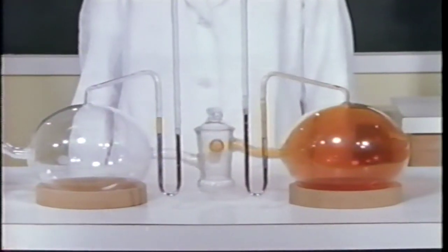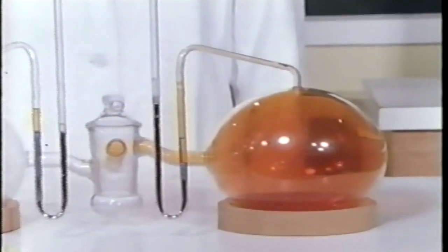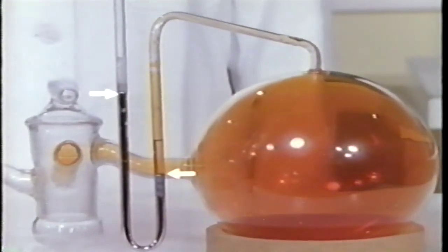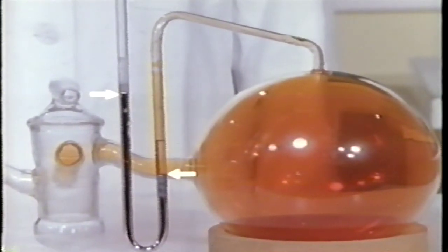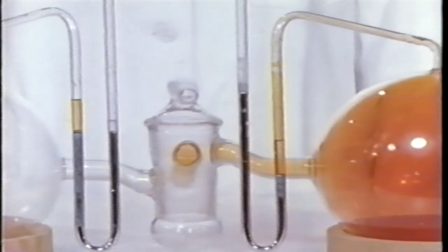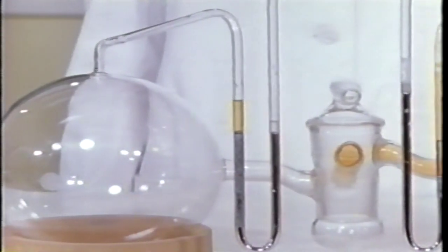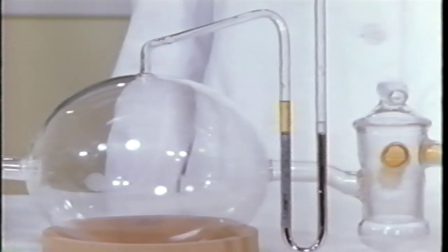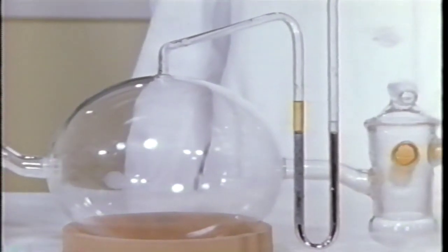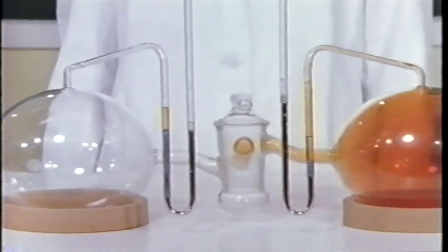Now let's look at these two glass bulbs. The right-hand bulb contains the colored gas bromine. The mercury levels in the manometer show that the bromine pressure in the right bulb is about 100 torr. The oil in the manometer is there to prevent reaction between the bromine and the mercury in the manometer. This second bulb has been emptied with a vacuum pump. The mercury levels in the left manometer show the pressure is 0. At first, all of the bromine is in one of the bulbs.